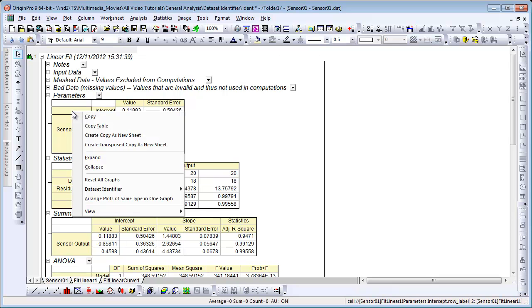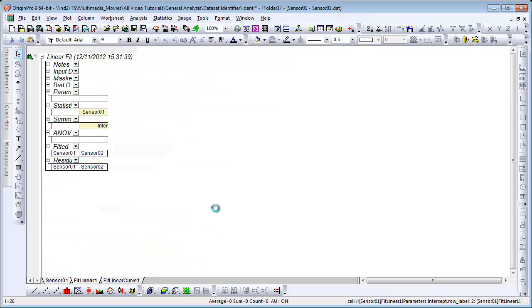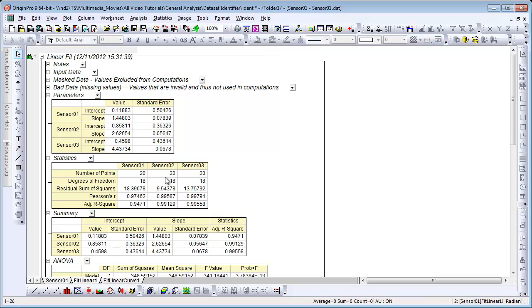So I can right-click anywhere here, choose Dataset Identifier from the context menu, and then change this to sheet name. The parameters table updates, correctly identifying now the intercept and slope for sensors 1, 2, and 3.